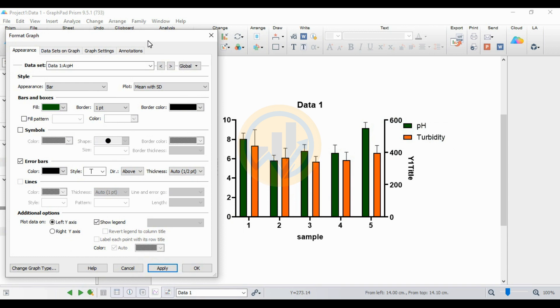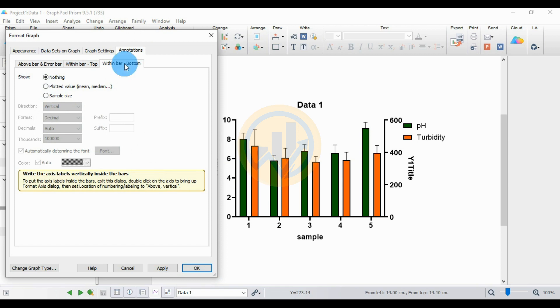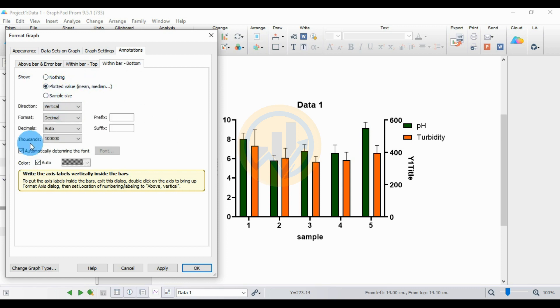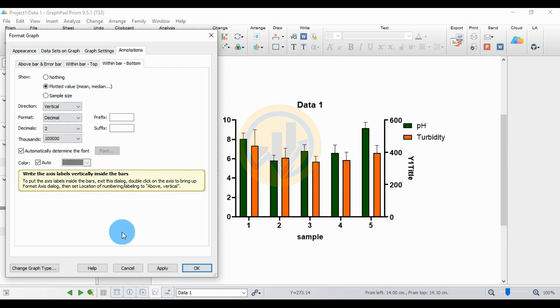The next option is to add values to our bar graph. Go to the menu with three options for data entered in our bar graph: the first is above bar and error bar, then within bar top, and within bar bottom. Use the option within bar bottom. The Show options include plotted value, mean, and median value — select this option. Then set the decimal value and click Apply. The data values are now entered.